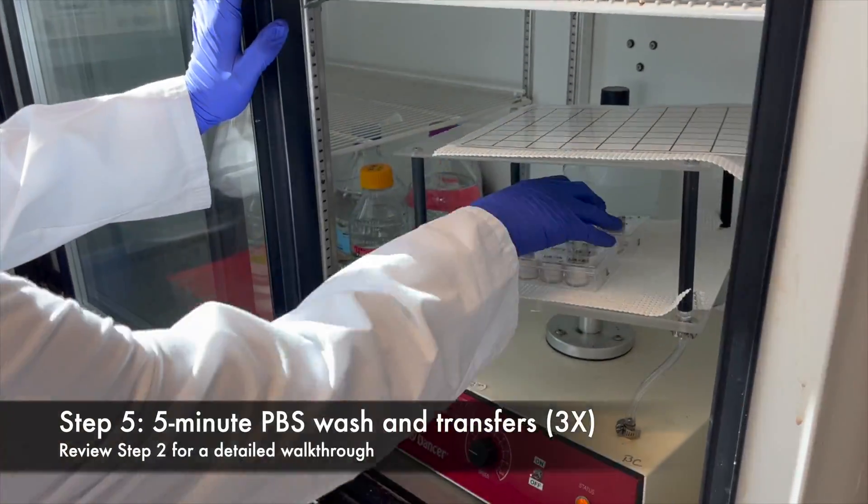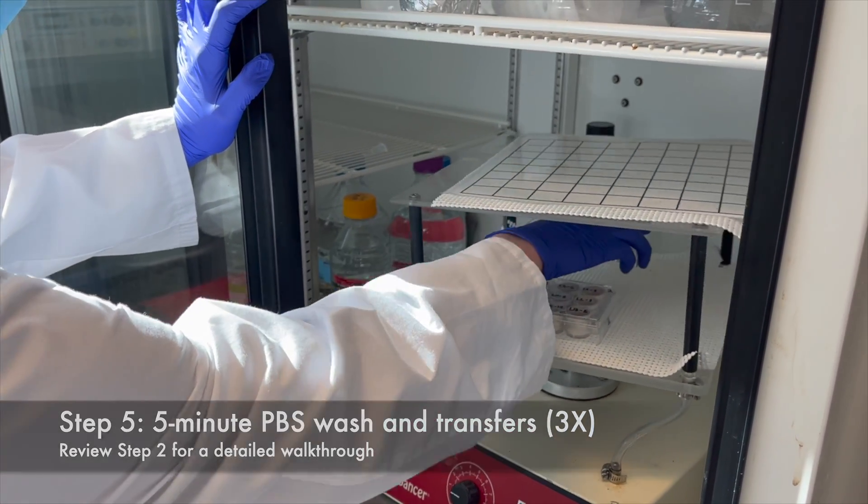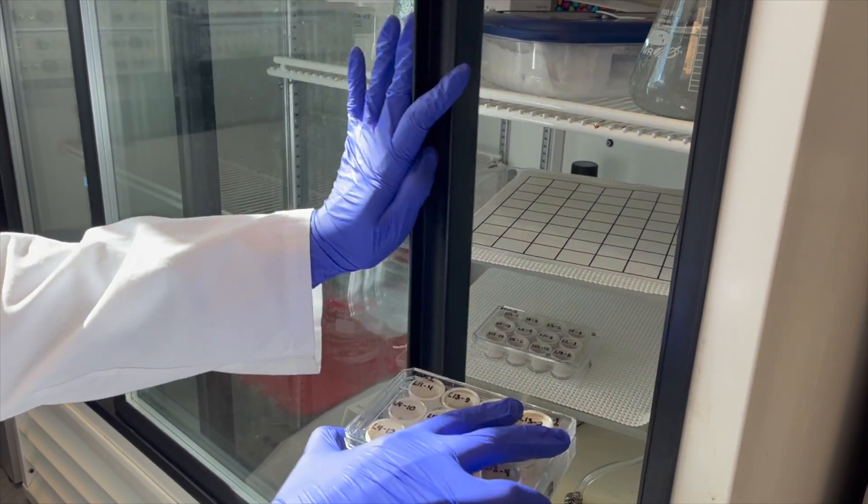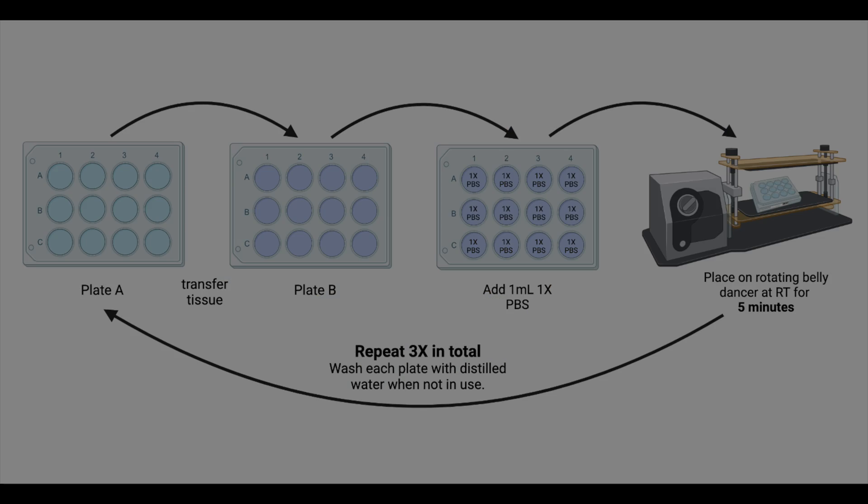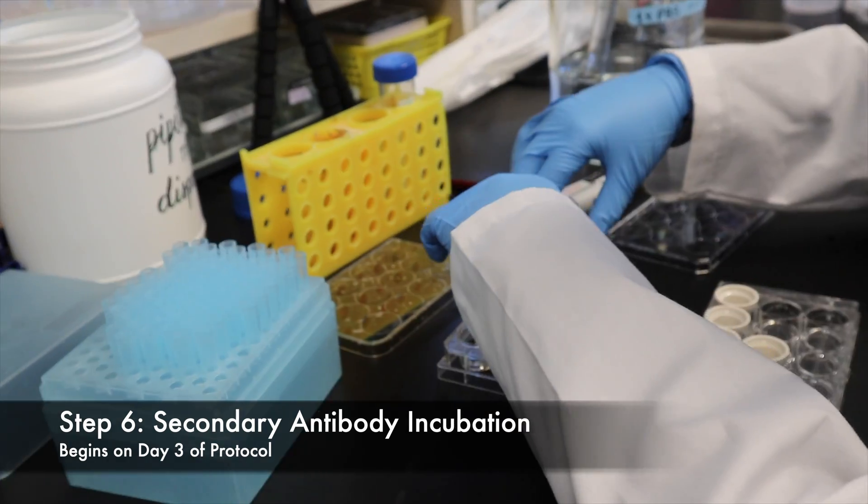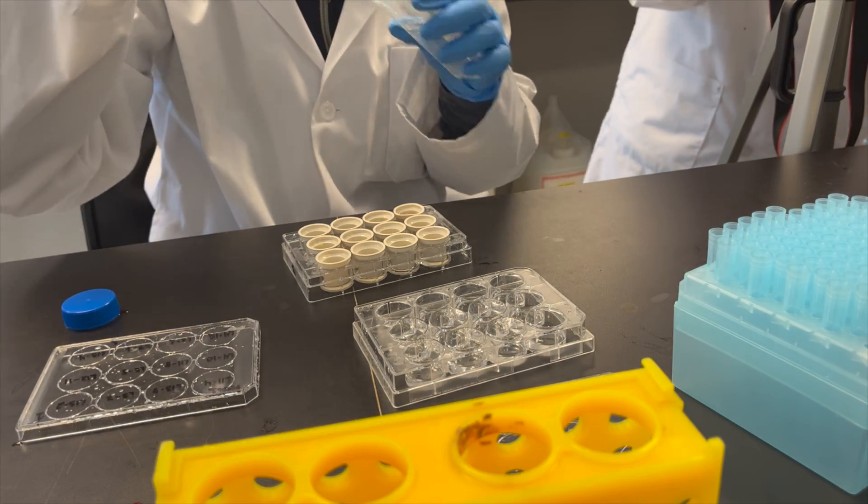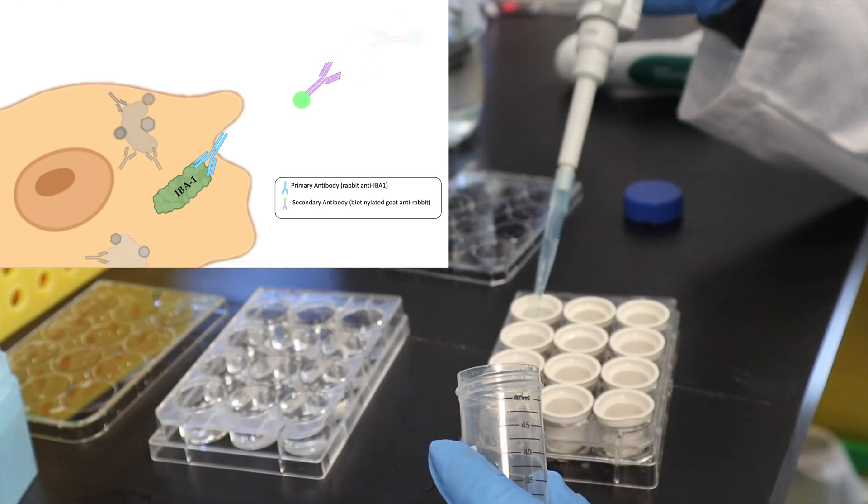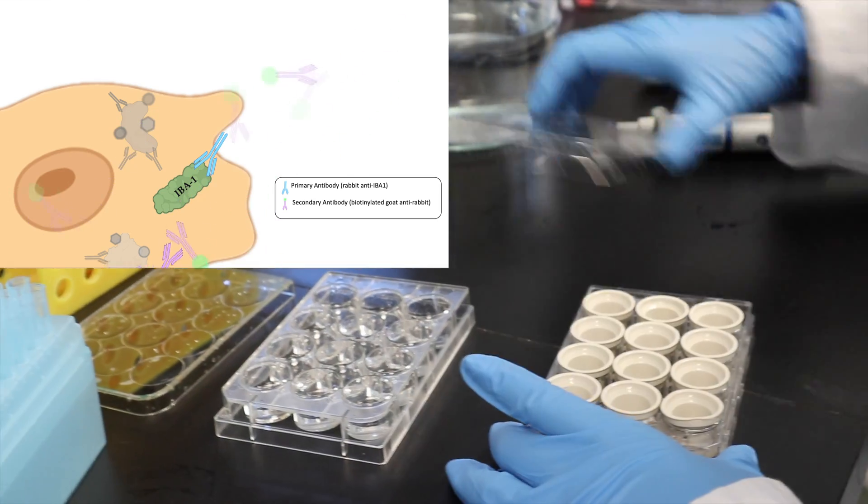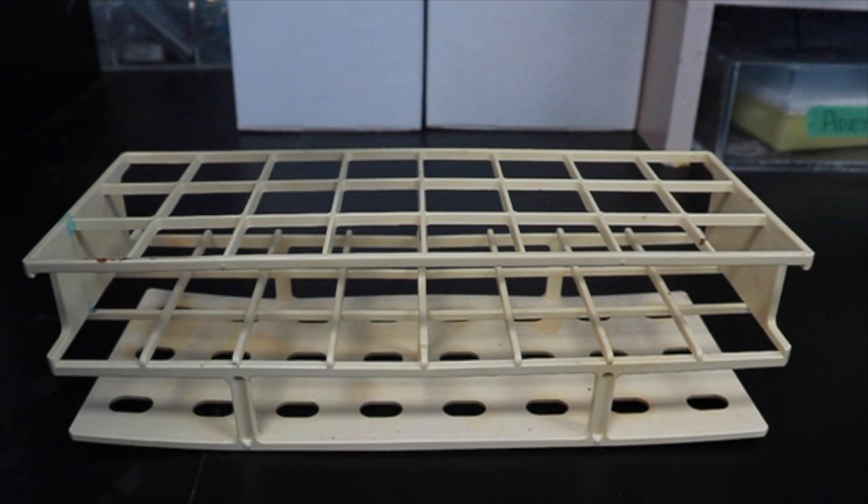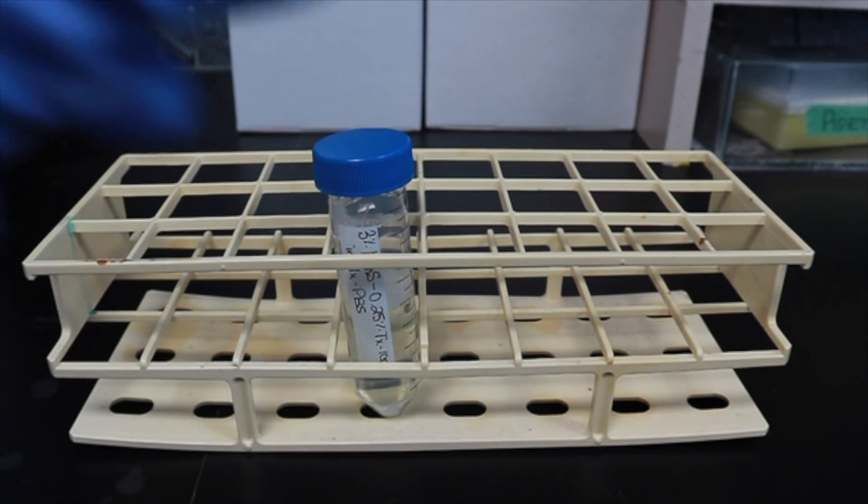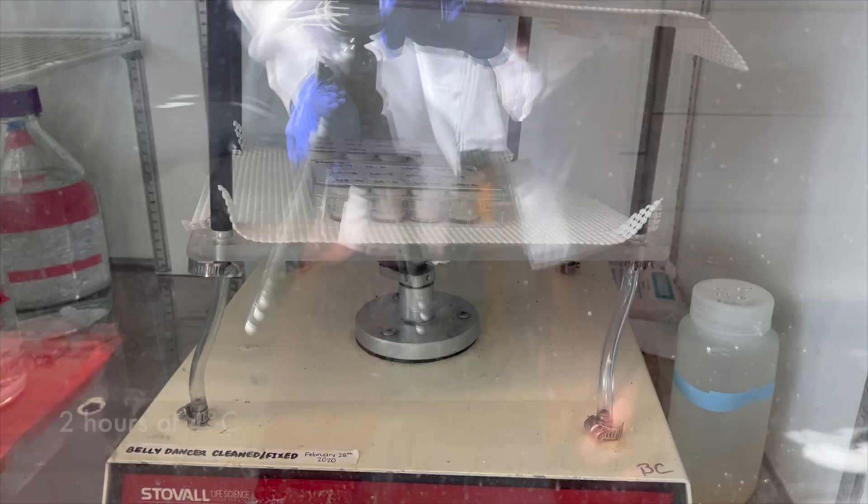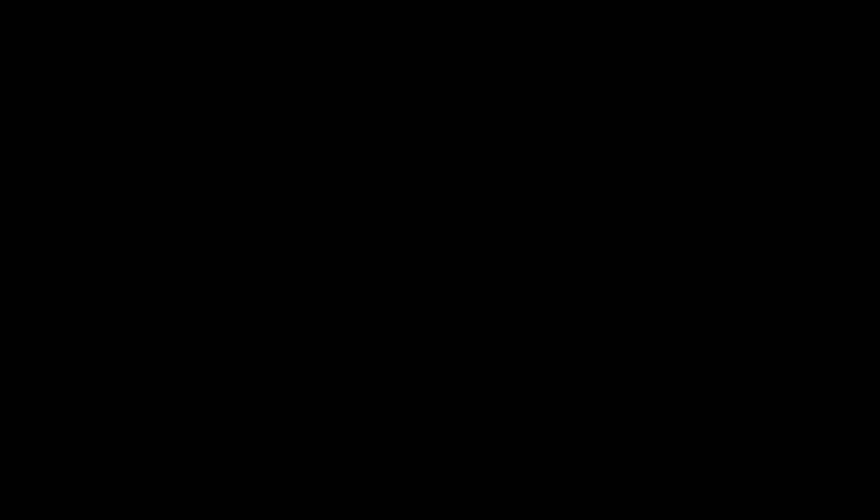To kickstart day 3 of protocol, retrieve your tissue from its primary incubation and perform 3 more 5-minute PBS wash steps as detailed in step 2 of this video or as summarized above. After completing the PBS washes, transfer tissue to a new plate and add approximately 1 milliliter of secondary antibody solution to each well. To make the secondary solution, you will need to perform a 1 in 500 dilution of biotinylated goat anti-rabbit secondary antibody in the previously made blocking buffer solution. Once treated, the samples can be incubated at 4 degrees Celsius for 2 hours.